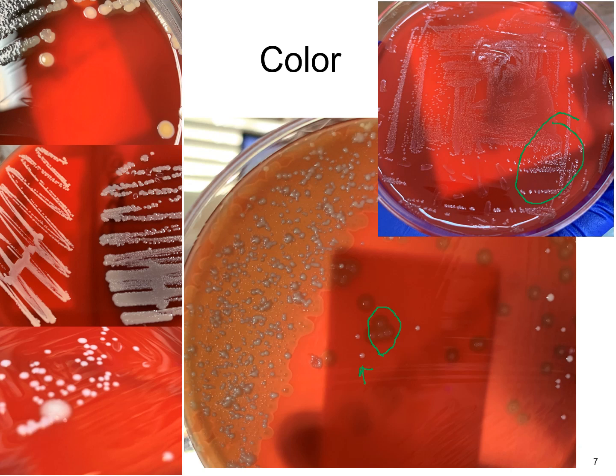You have some over here that are kind of yellow, or some people may say buttery. With these, you can also see a little bit of a raised center, so it gets a little bit darker in the center where you have more organisms, and it kind of has a little peak. And then the rest of these have more of a white look to them.